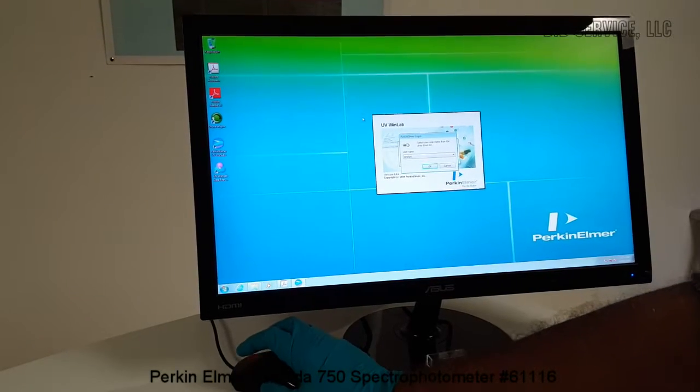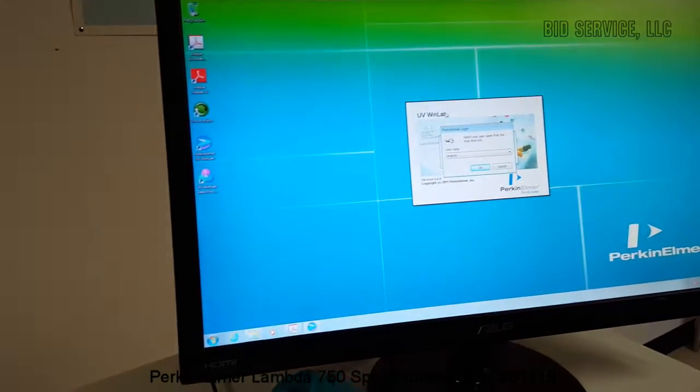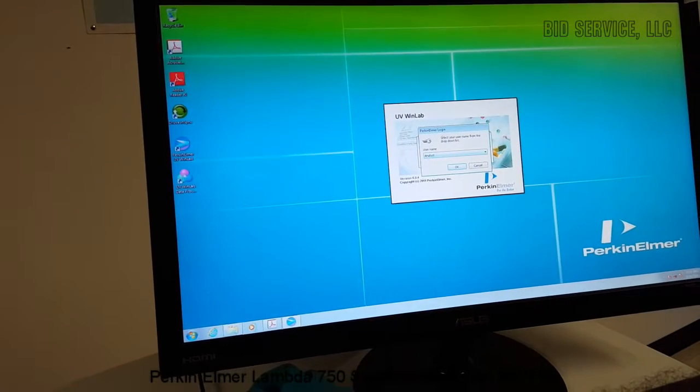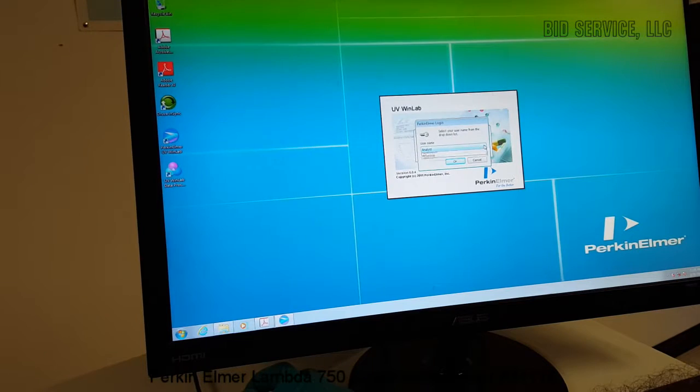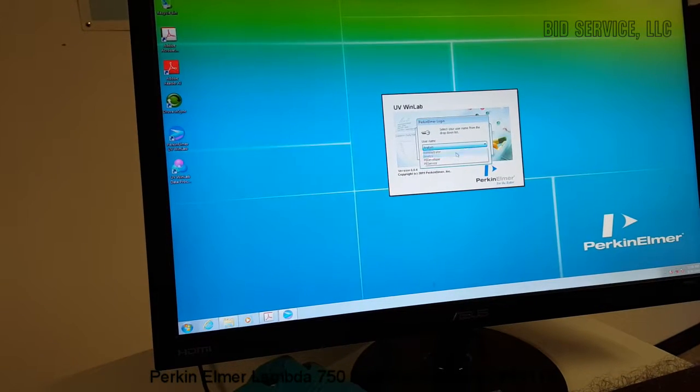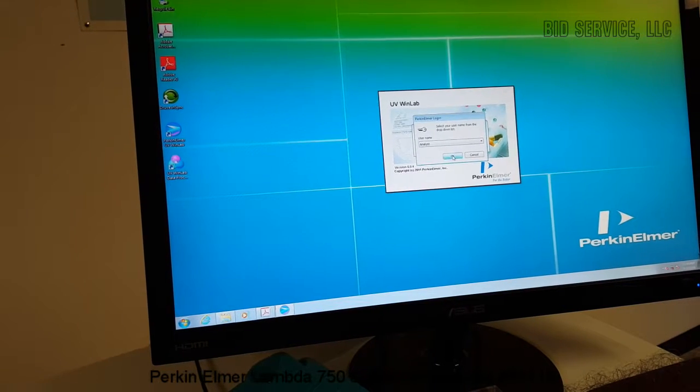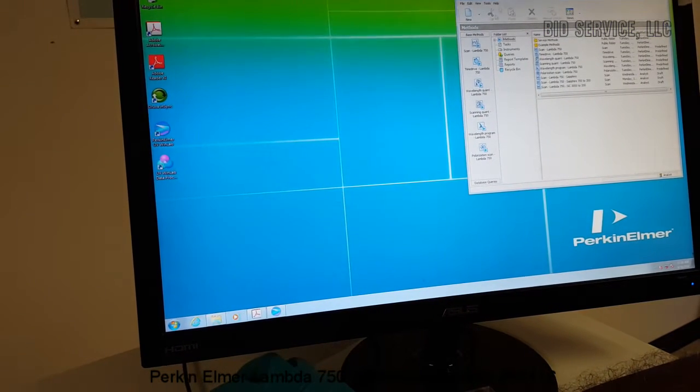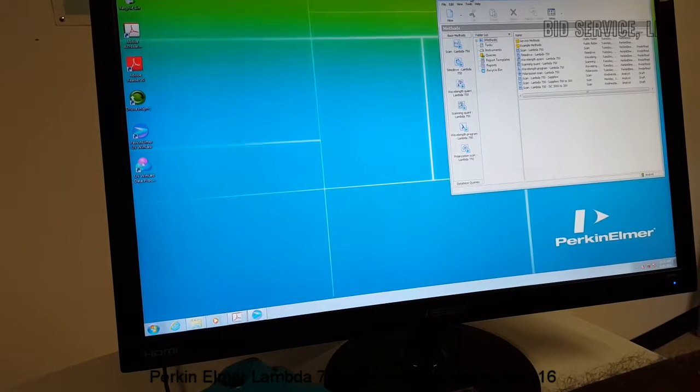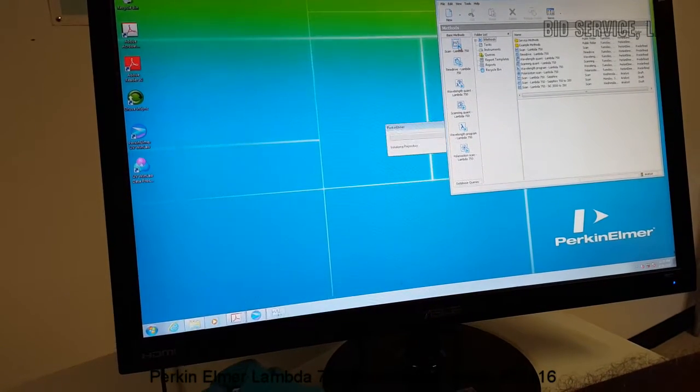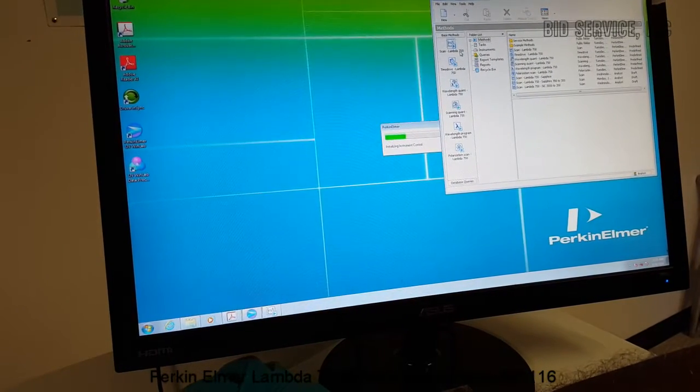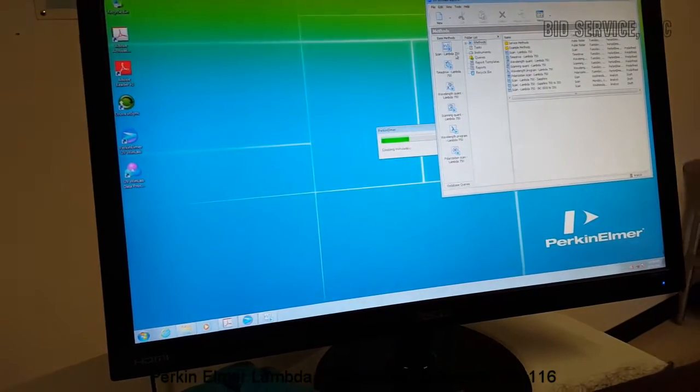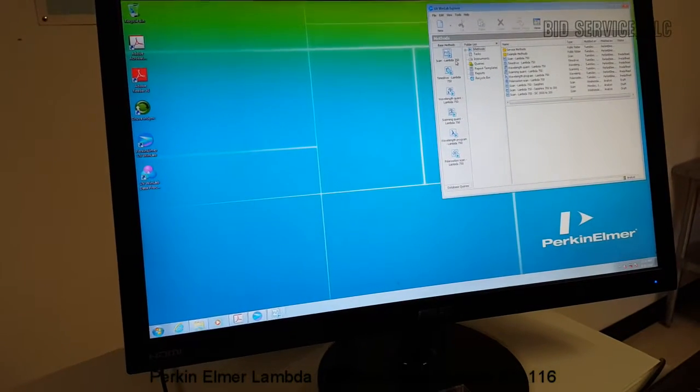So as soon as we click on the UV WinLab application, a Perkin Elmer login window will appear and you can select Analyst to proceed with the analysis of the samples. And then the WinLab Explorer window opens up and then once we click on Scan Lambda 750, another window, the method window, the base method window will open.